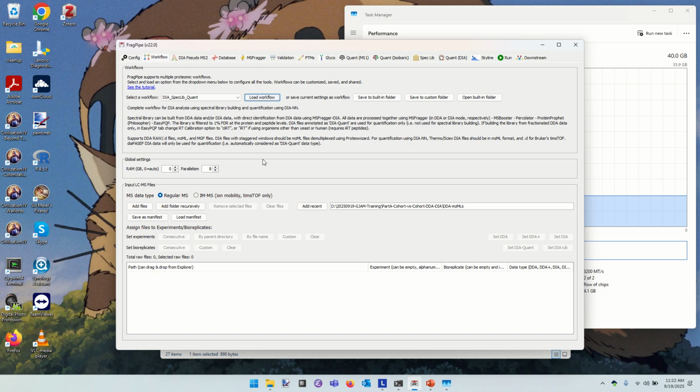So this combination of a list of peptide sequences and the spectra that associate with them is called a spectrum library. If you see this, it means this peptide is here, in short. The quantification step is then to use that spectral library and ask, what intensity would we attribute to each of the peptides in this library that we just built from the data?